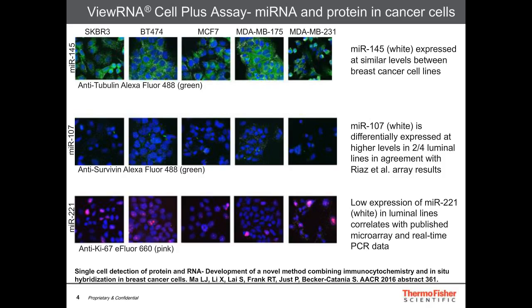So these are all breast cancer cell lines. The SKBR3, BT474, MCF7, and the MDA-MB175 all fit into a category that's more a luminal type. So these display an estrogen receptor signature, and they resemble luminal types of tumors. The MDA-MB231 cell line is a more basal breast cancer line, which displays more of a BRCA1 signature and resembles basal-like tumors with mesenchymal and stem cell characteristics, actually.